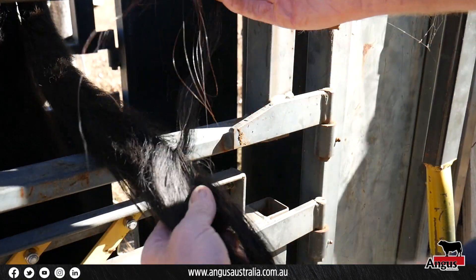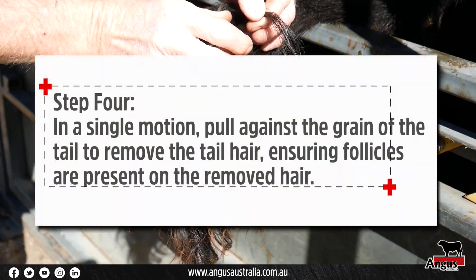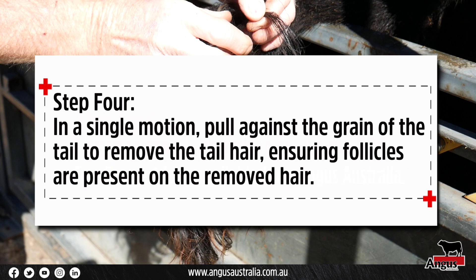Holding the hair close to the base and in a single motion, pull the hair against the grain of the tail, meaning up and away from the way the tail hair lies naturally.